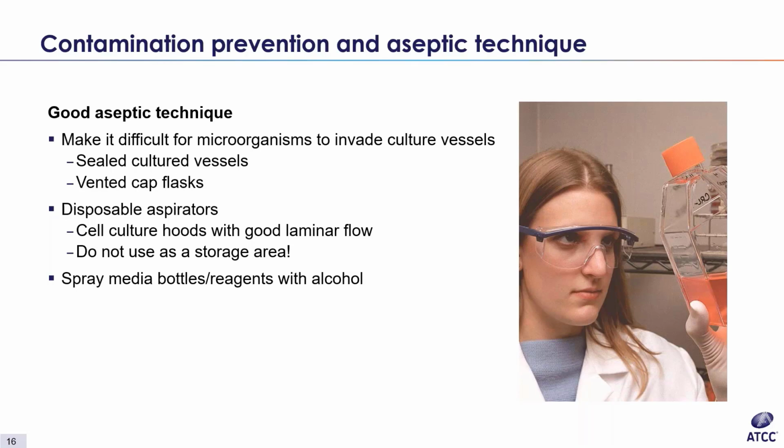I always use disposable aspirators and pipette tips that are pre-sterilized. Make sure that your hood has adequate laminar flow and never overcrowd or leave materials such as boxes or bottles in the hood indefinitely. This can impede proper flow and block attempts at cleaning and wiping down the hood surface. When bringing media and reagents into the hood, always spray the items down with alcohol to remove any contaminants.